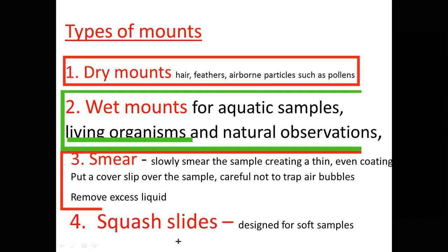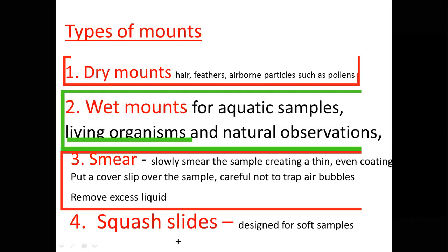Instead of observing the cell that we intend them to see, you find a student has drawn an air bubble, drawn it nicely, and tells you that it is bacteria. He even shows the teacher, look at that, and when you look, it is an air bubble, and that is what he says is a cell. So that is something that we need to watch as we move on.